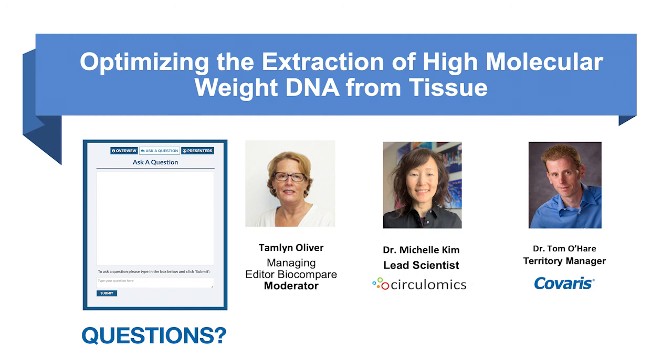We have a buffer in our process that washes away some of this extracellular matrix and things like salivary components or other high carbohydrate elements that are not actually part of the cell. So that's what I would recommend. You could wash your sample before you add this buffer, which presumably is a lysis buffer.